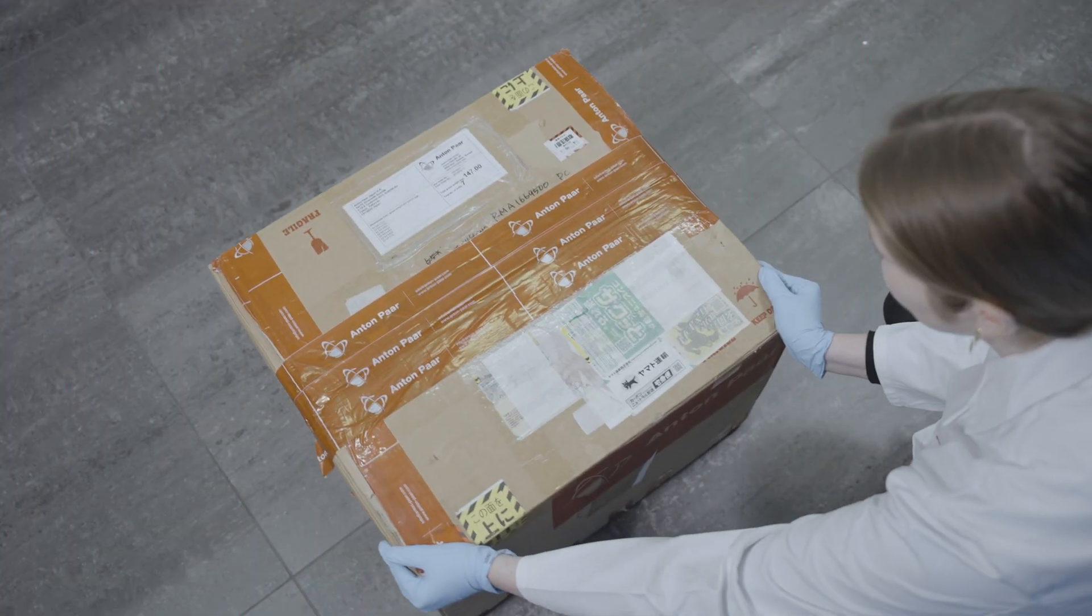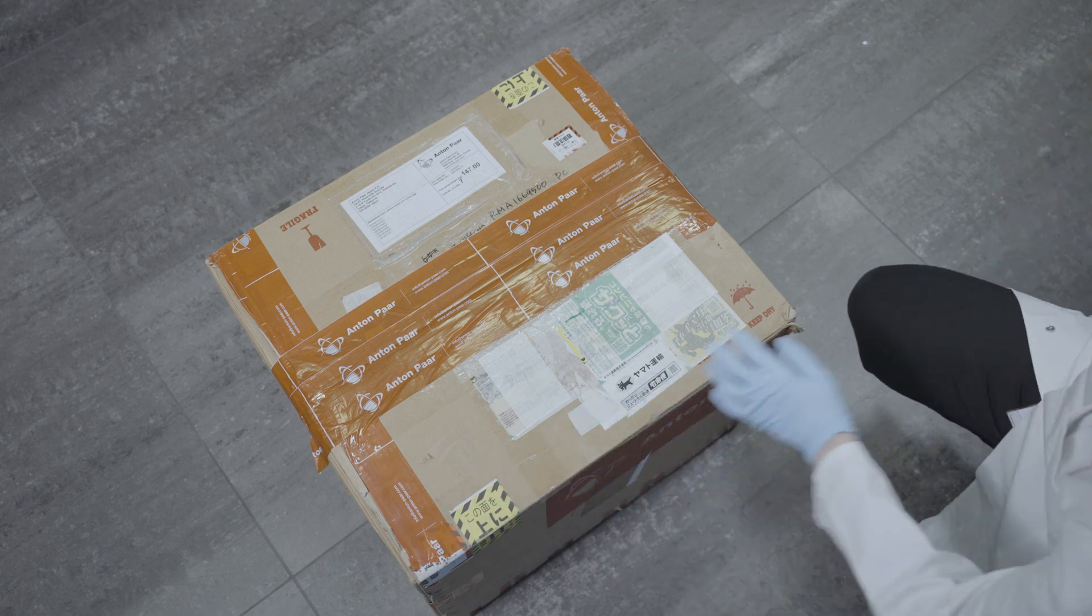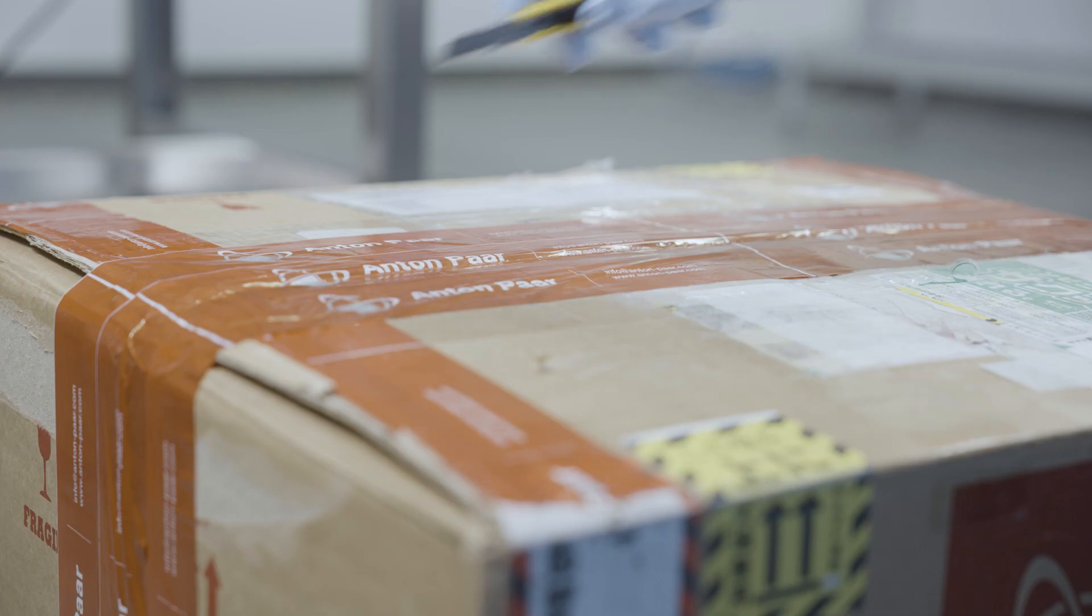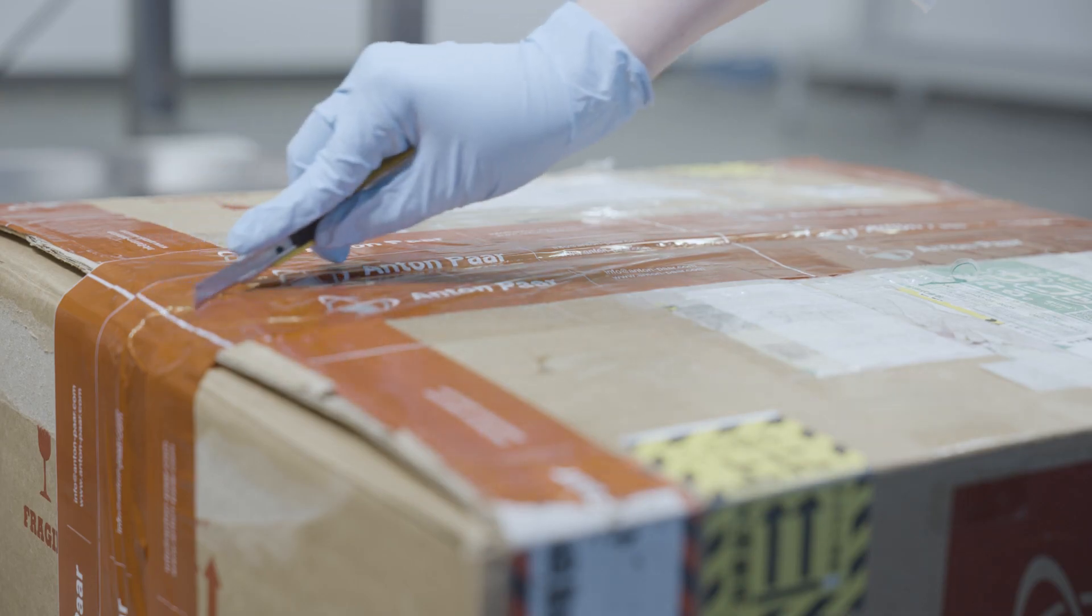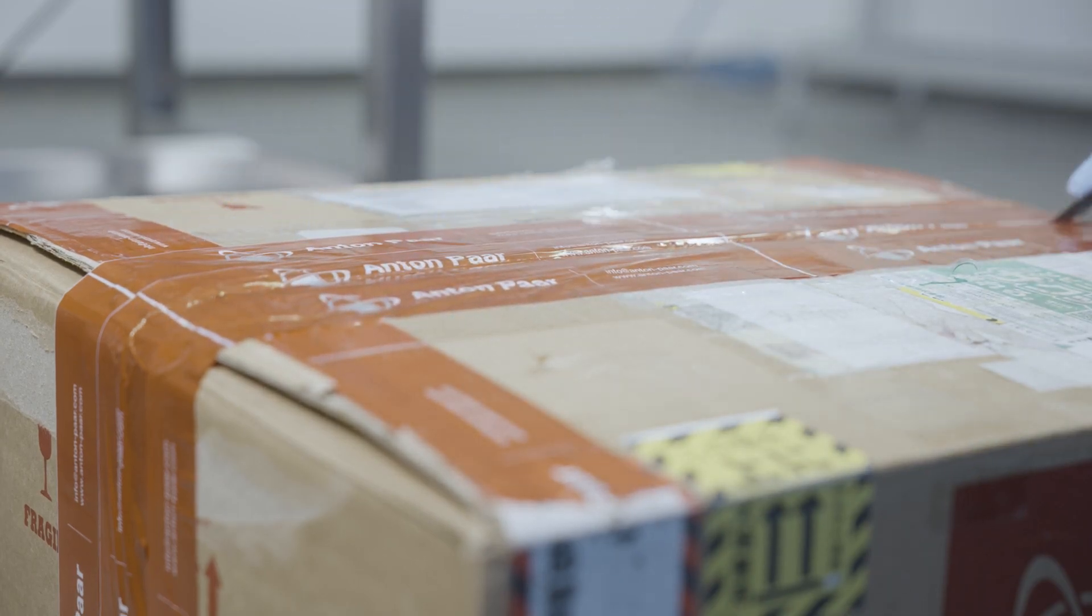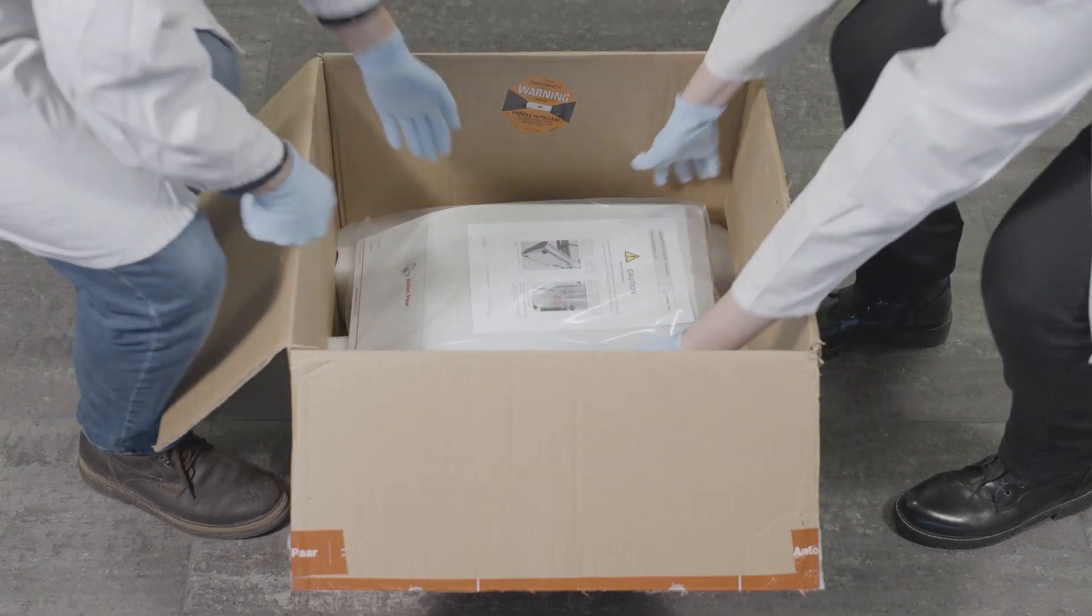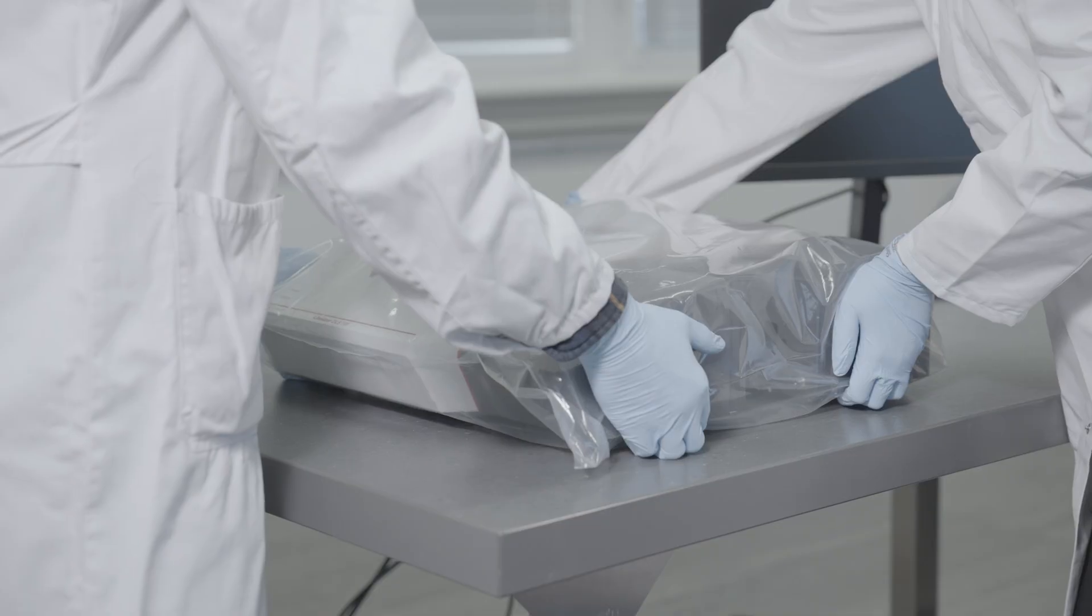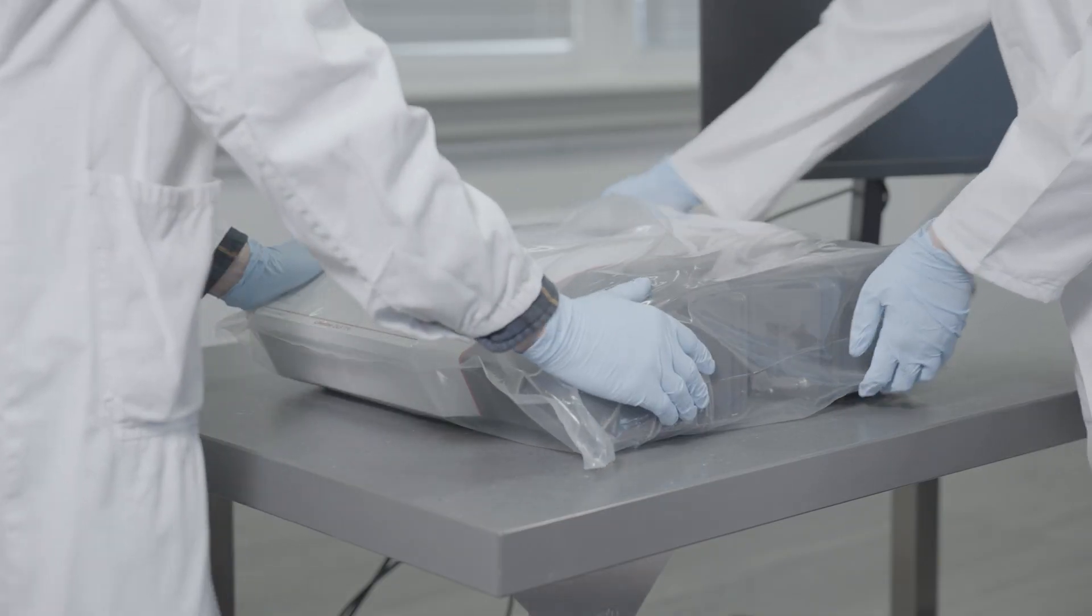The LightSizer DLS 701 is delivered in a package together with a variety of accessories. Lift the instrument out of the box and place it on a leveled bench.